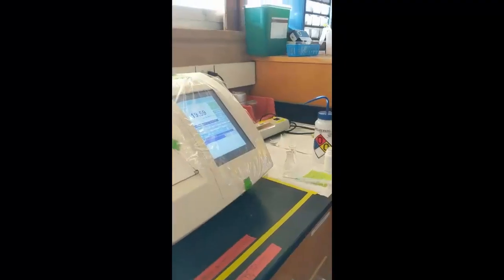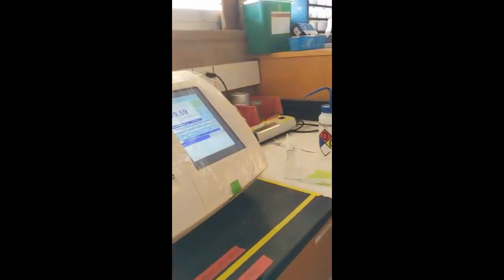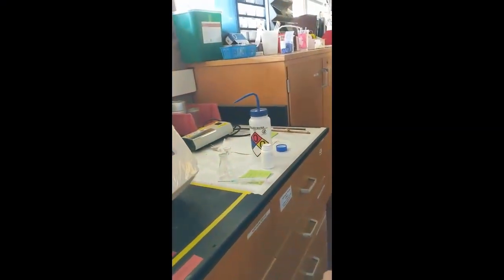Now we have our specific rotation. You just document that, right? And that's it. It does tell you what the temperature is, which is good. It tells you it's 21.9 degrees. But that's pretty much all you need.